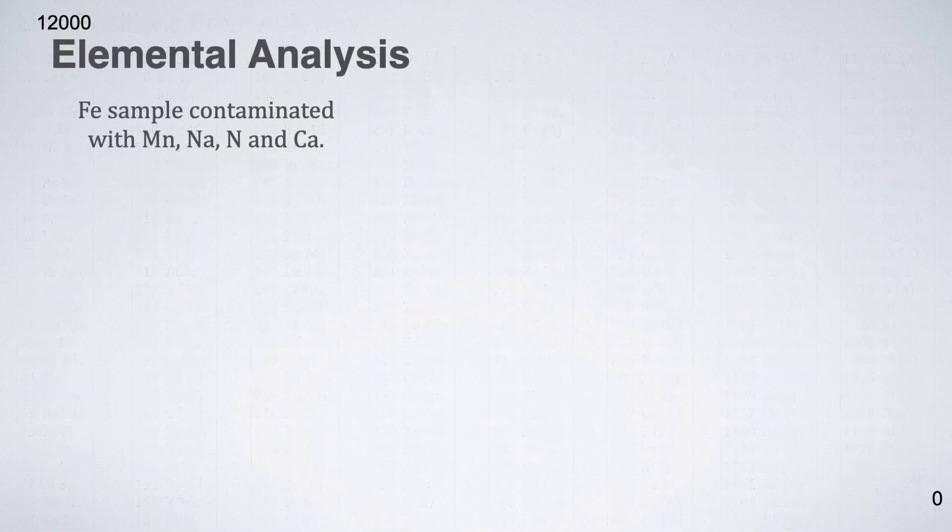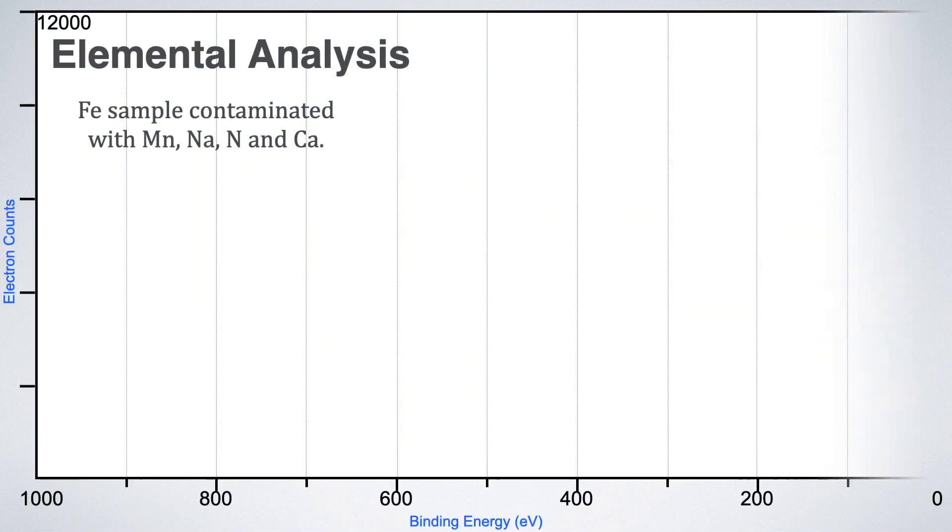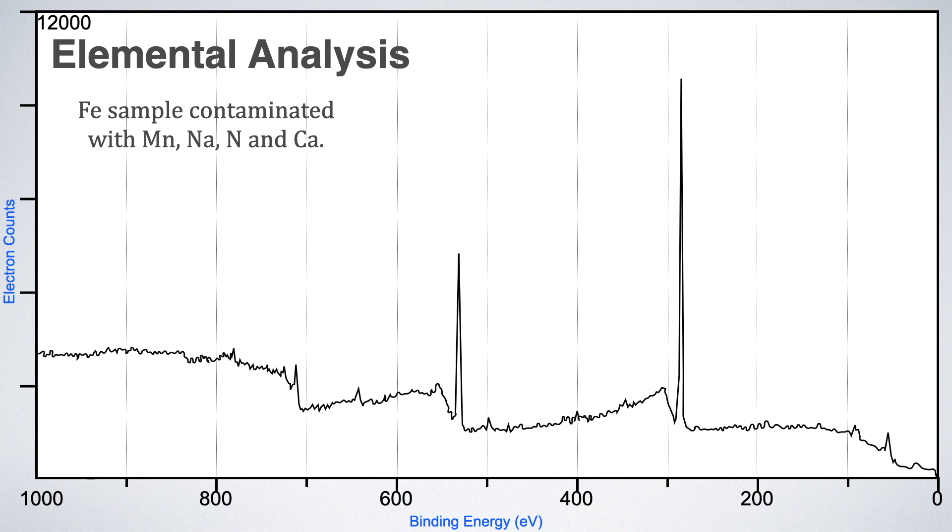Now, let's try to find the unknown peaks of a sample of iron. Here is the spectra which shows large number of small peaks. So, let's start. The peaks at 720 and 707 electron volt corresponds to iron 2p peaks. They are split into two because of spin orbital coupling. Then, there are iron 3s and iron 3p peaks at 91 and 53 electron volts respectively. But, still we have more peaks.